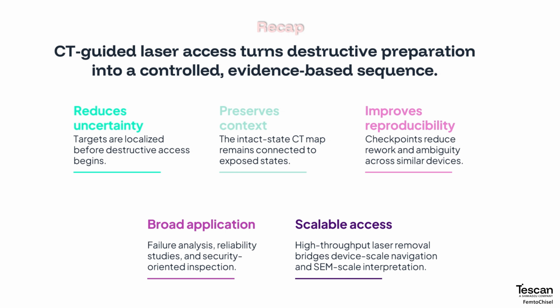This approach can reduce rework, improve reproducibility, and provide a scalable pathway for advanced package failure analysis, reliability studies, and security-oriented inspection.